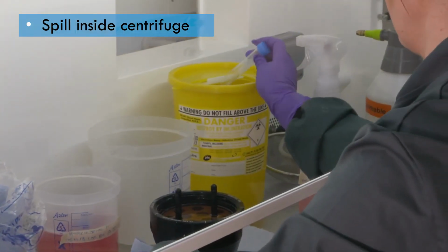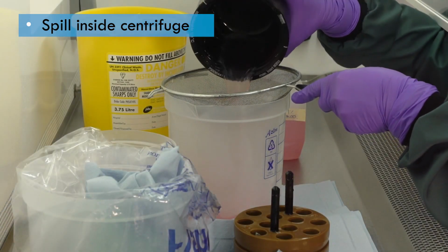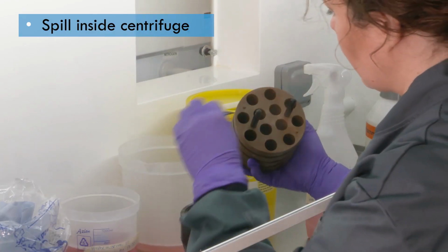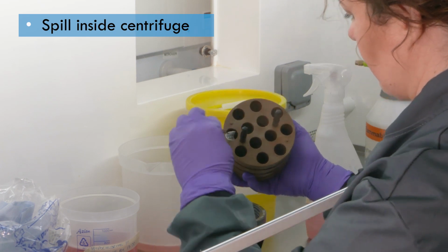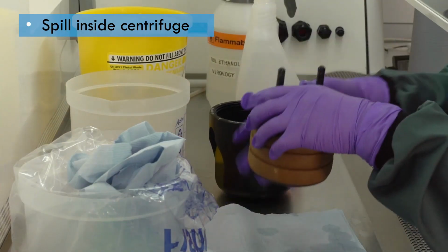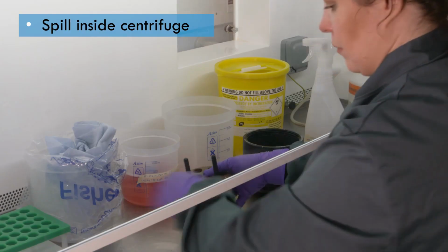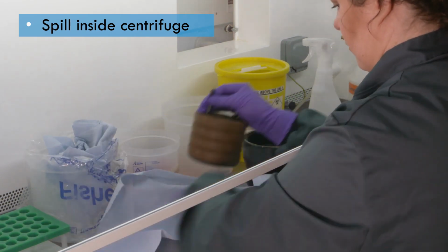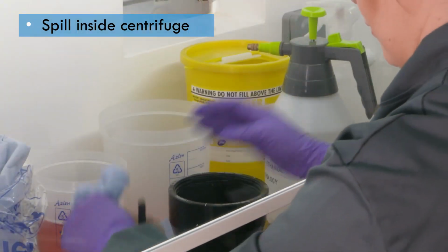Remove any large pieces of broken tube, then pour the contents of the bucket or rotor through a sieve to capture any small pieces. Using forceps or tweezers, place broken pieces directly into a sharps bin. Mop up any remaining disinfectant using absorbent tissue and place in a suitable container for autoclaving or immerse in disinfectant. Remove any chemical residue with ethanol or water and dry thoroughly.